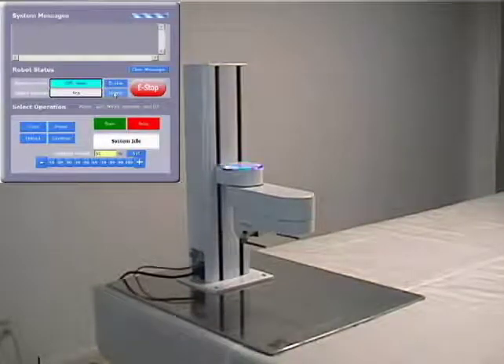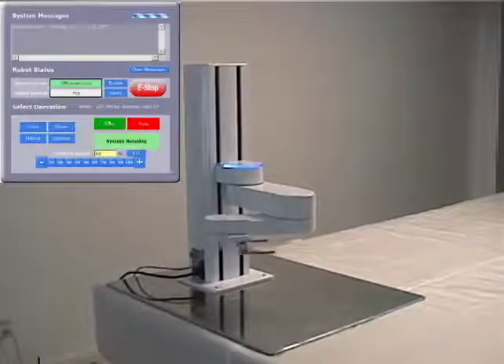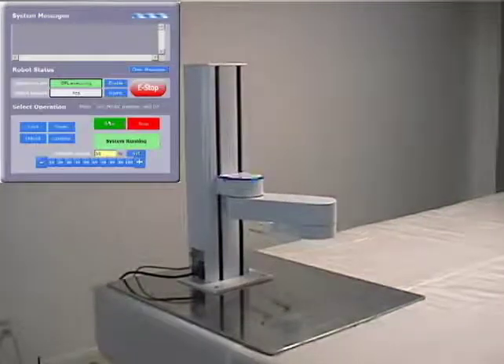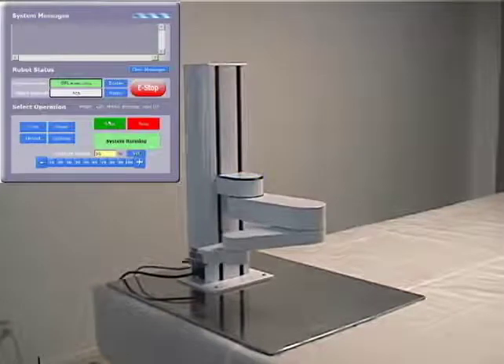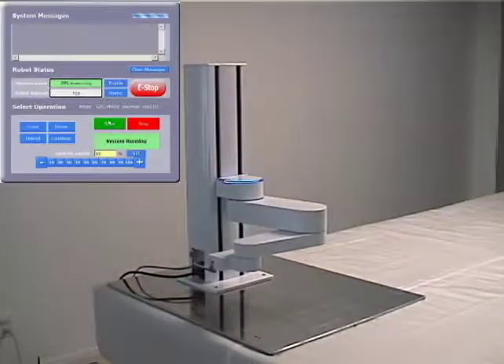After the robot is homed, it can immediately begin executing a motion program. The use of servo absolute encoder motors means that, unlike robots with stepper motors, the PF400 exhibits extremely smooth, quiet operation and does not need to be rehomed due to position drifting.